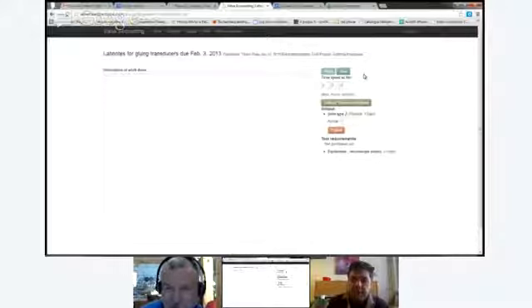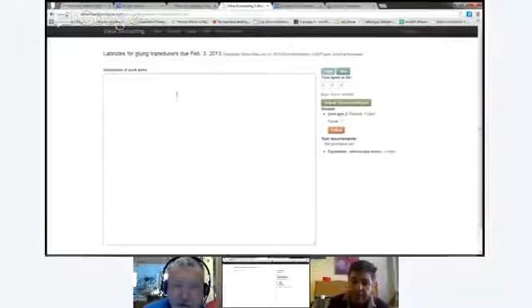At any rate, that button below says submit time contribution. There you submit it. Then you submitted your time contribution, and you can do that over and over again. It will just continue to add up. If you go back to these lab notes and keep working on it, it will add more time for that particular contribution. Francois, can you just type some text in there and write 1 hour?